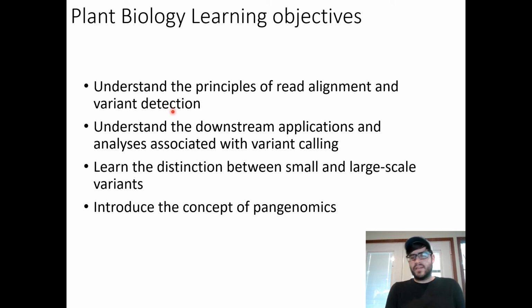So again, I just kind of skimmed the surface here with a couple examples. You could take whole courses on this. There are tens of thousands of papers, and there are whole fields associated with this. This is really a starting point of getting your list of variants, and there are lots of things that you can do depending on the research questions you have.